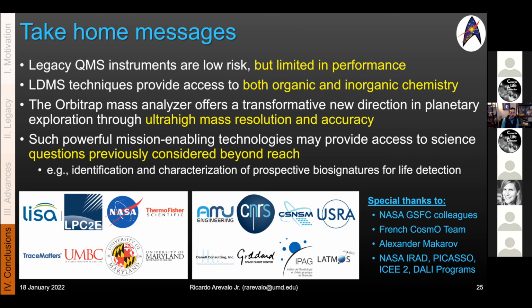Again, our sensitivity, our detection limit, I'll say, and I guess it's probably true for a lot of analytical techniques, is going to be controlled by the ionization energy, and maybe in our case, the desorption threshold of the sample.